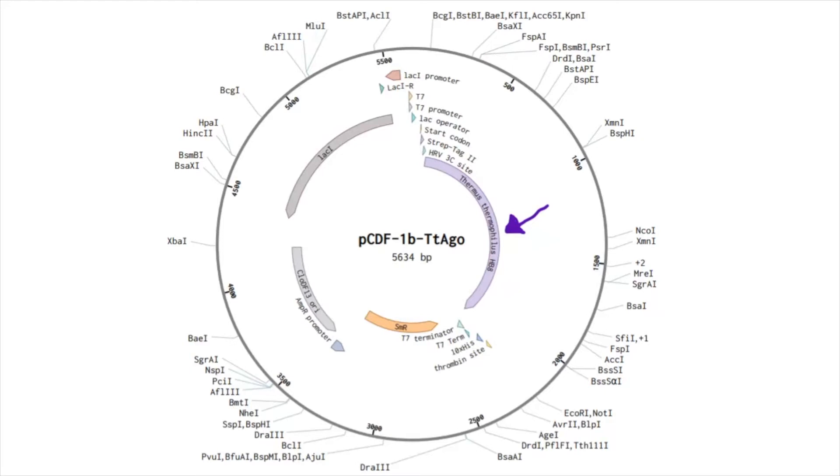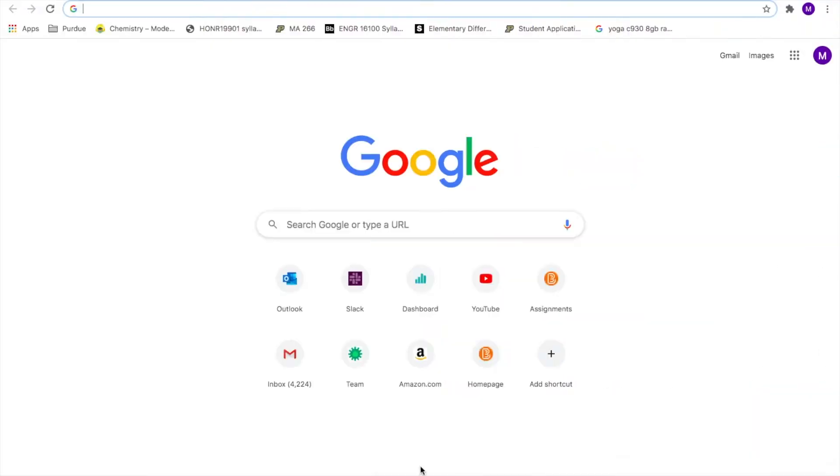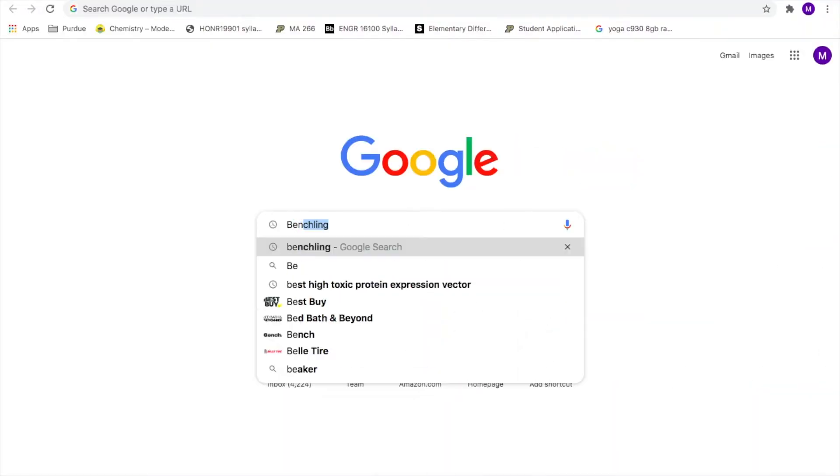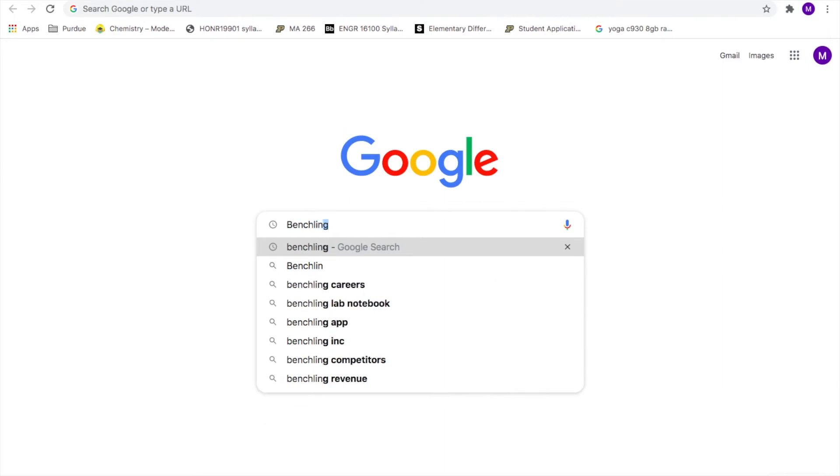From looking at our plasmid, it is clear that we will need at least two restriction enzymes to cut out our gene completely, on this side of the gene, and another on the opposite side of the gene. Now that we have taken a good look at our plasmid as a whole, let's open it up on Benchling.